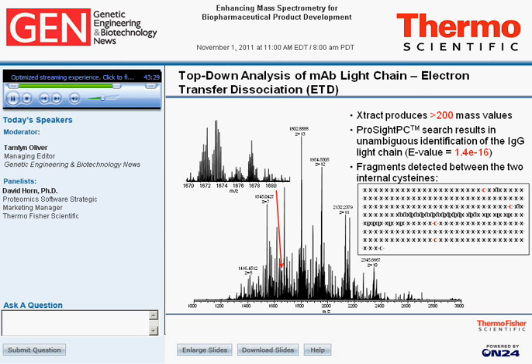So that localizes the disulfides to those pairs of cysteines, and actually those are the disulfides we would expect for the light chain. So in one experiment, not only do we confirm that those disulfides are there and their localization, but we also have complementary fragments, N-terminal and C-terminal fragments in the middle of the sequence, which matches exactly what that sequence should be from that point to either termini, which means we have 100% sequence coverage. Next slide, please.